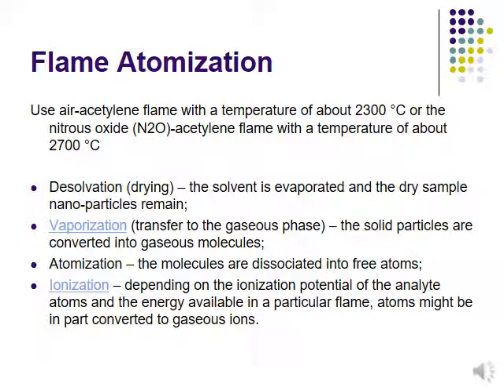For the atomization, you must remember there is a difference between vaporization and atomization. In atomization, the molecules are dissociated into free atoms. So it doesn't belong to the gaseous phase anymore, but it refers to free atoms.